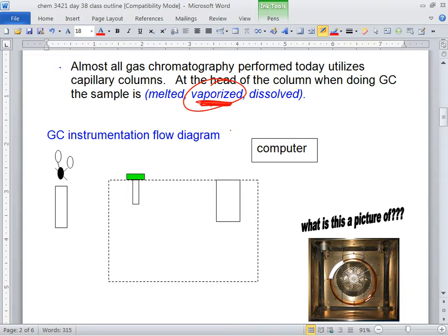Is it like the mobile thing? Yeah, no. It's the Mickey Mouse looking thing. The Mickey Mouse looking thing is where our mobile phase is. I tried to draw it with the, it's called a gas regulator. When you walk in and you see these big, tall metal cylinders, there are two dials on there, two gauges. One gauge reads the pressure coming out of the cylinder, and the other reads what's in the cylinder. So that's really how this thing works, and it comes over to there.